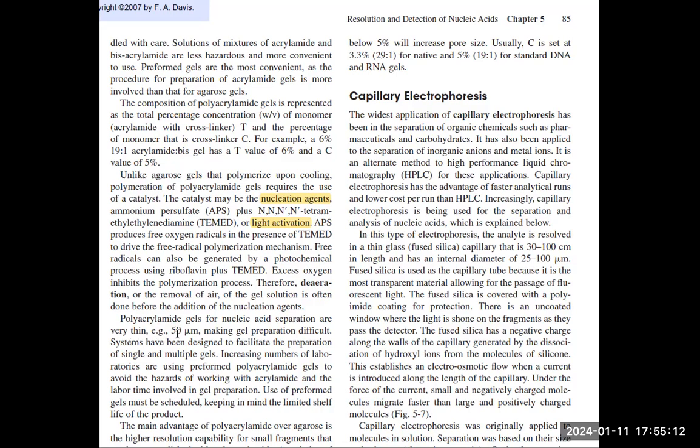And think, guys, PAGE gels are very thin, like 50 micrometers only. So the preparation of this gel is really difficult, so it's better to buy the preformed or precast gels.